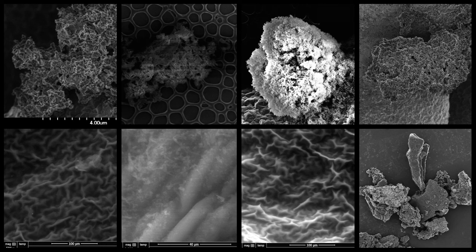So with proper sample technique and a little bit of playing around at the instrument, you are able to get high quality images of nano-scale features.